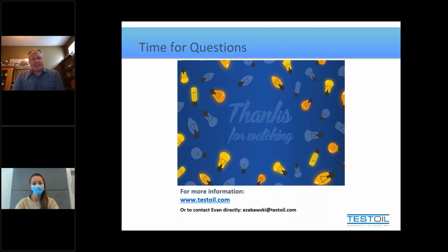What I would caution you on, and this actually works in your favor almost, is that portable or online, inline, whatever you want to call them, particle counters that people can use on site tend to report a little on the high side only because of sample preparation. Most people run their samples neat through these machines, whereas at the lab, we do a little bit of sample prep if we're going to do the same optical measurement that you would do, because we want to remove air bubbles, water molecules, and soft varnish particles from being counted as well.